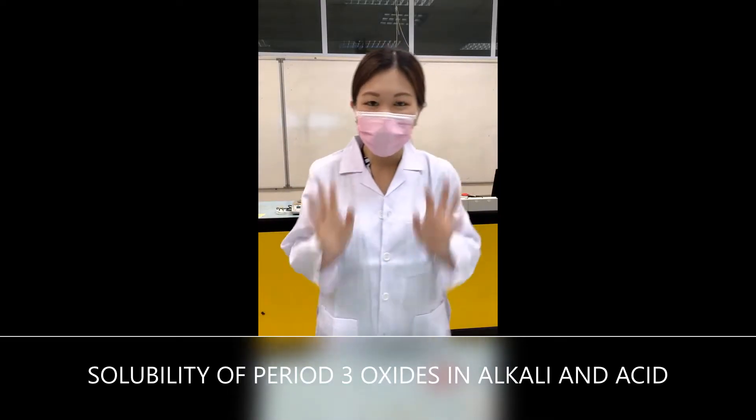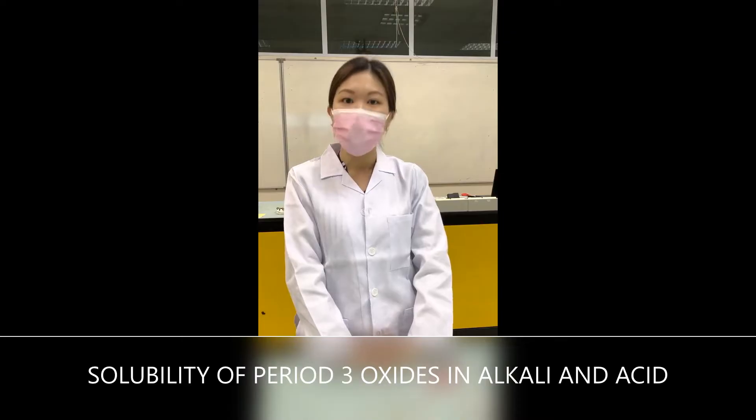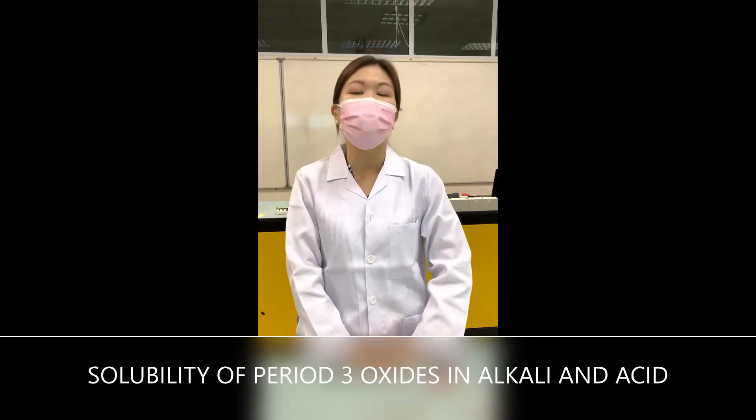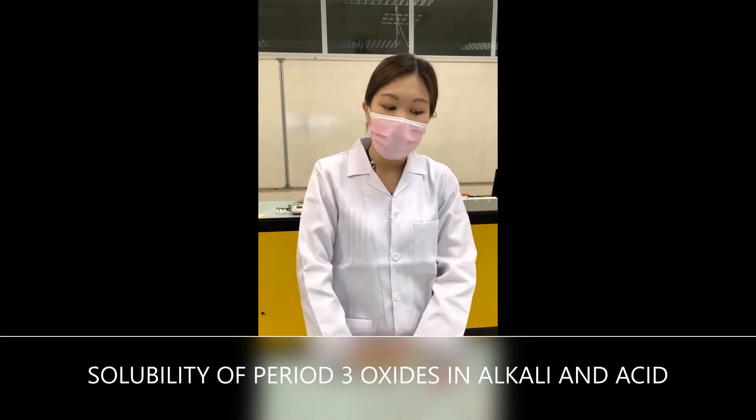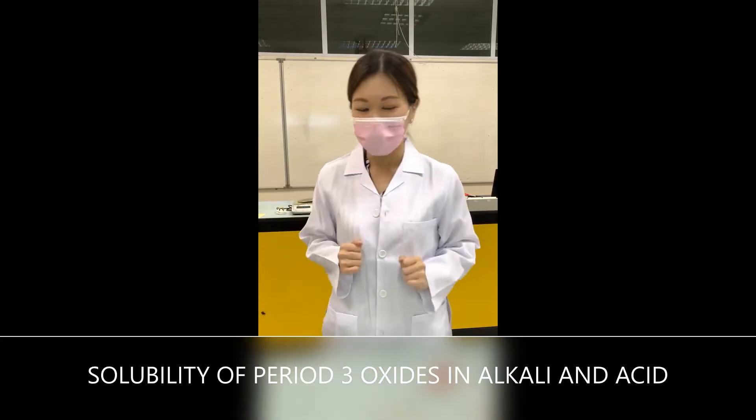Hi guys, morning! So today we'll be doing a lab related to period oxides' reaction with sodium hydroxide solution and nitric acid. We're going to see whether these oxides will dissolve in both solutions or not. Let's check it out!